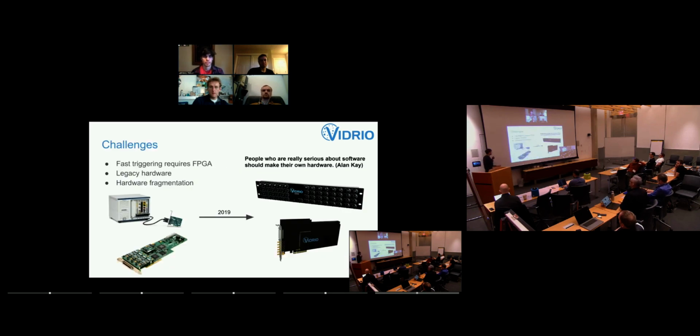Okay, so now I want to talk a little bit about the challenges that we face in ScanImage, right? Several of the speakers already mentioned that a big part of making your microscope work is getting all these devices synchronized. And the way that we do that is we use an FPGA to run an acquisition engine. So we don't run the acquisition engine on the computer itself.